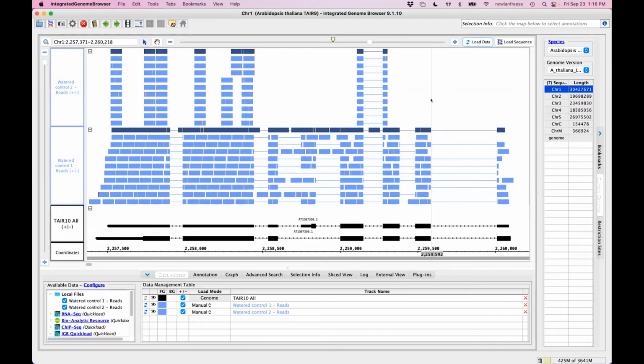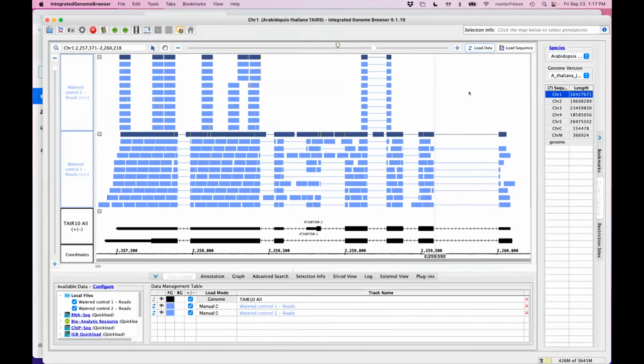Okay, so that's the first scenario. And again, this is kind of like a quick sanity check. So the ability to look at your data and say, does this look good or not? Now, this is RNA-seq data, so probably what we're really interested in is looking for differential expression. So let's jump back to BioViz Connect, and we will load some additional files and take a look.